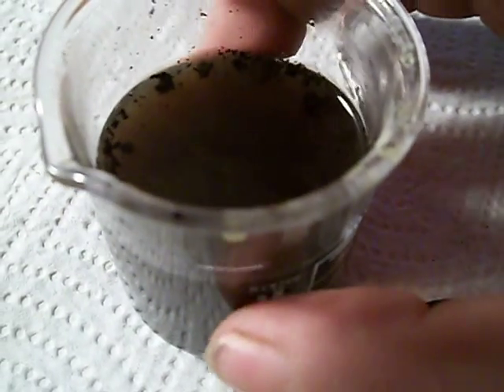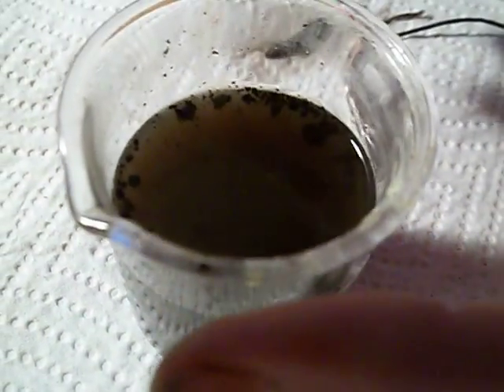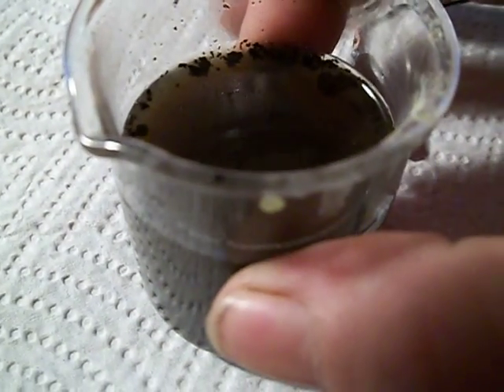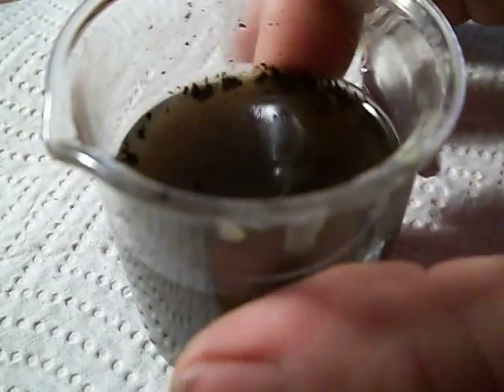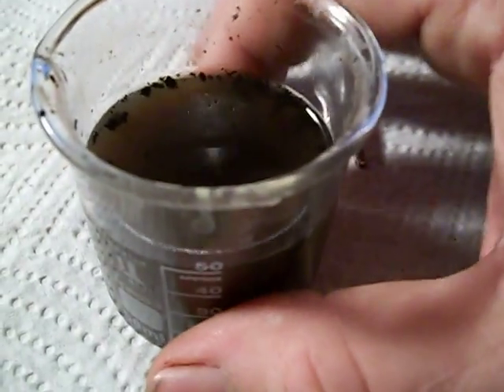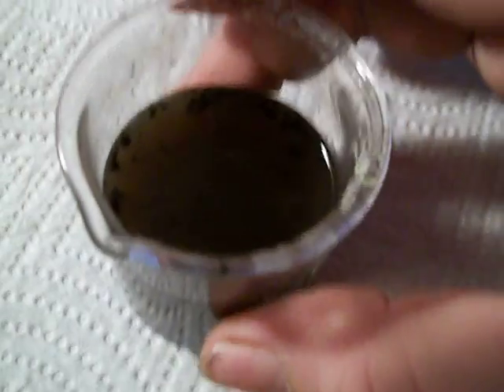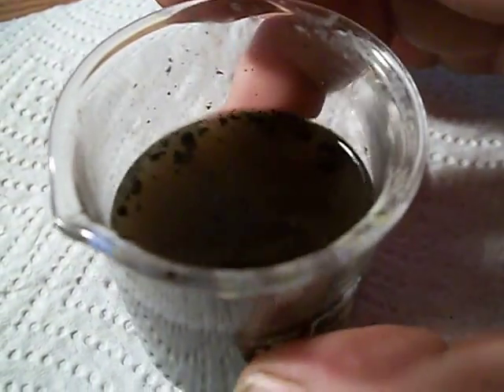When tomorrow gets here — because it's snowing like a devil out here right now — I'm going to take this thiosulfate solution off and get the silver out of the bottom and see if I can do something with it to make it look more like silver, but right now it looks like black powder.